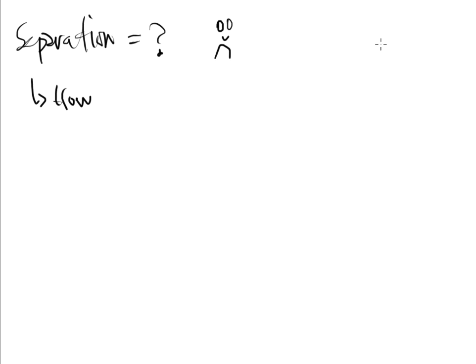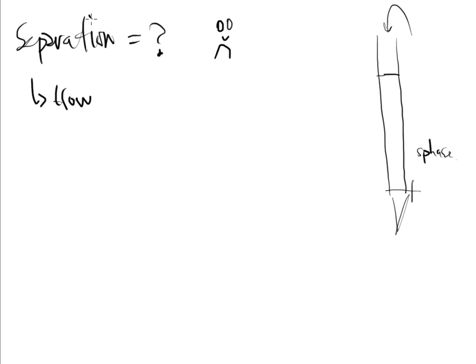Okay, so imagine yourself in the laboratory and you've got a column in front of you right now, and that column is filled with stationary phase. And that stationary phase allows the separation to take place. And we put a sample into the top. And let's say that that sample has two components in it. We're just going to keep it simple. We've got a red component that's going to be present, and let's say that we've got a blue component that's going to be present.